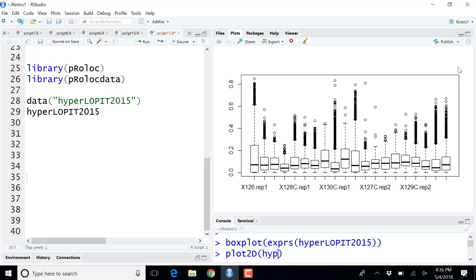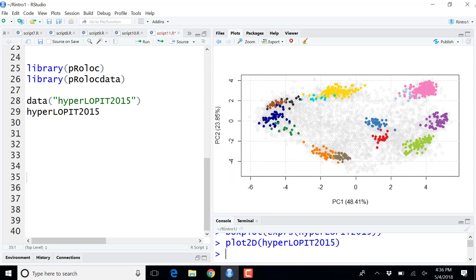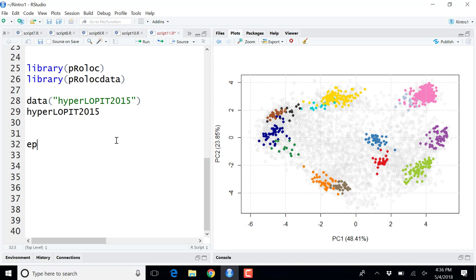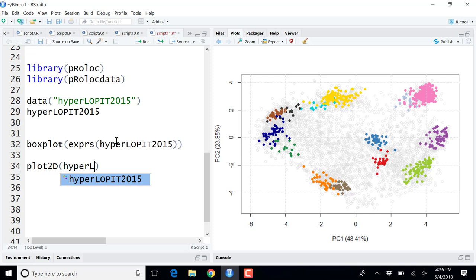And here's a final figure that I would like to show you. Let me type this here, so you have it. This function would create a PCA plot and a summary of your data, where each point represents one single protein. So we have 5,032 points on this figure. But instead of each protein being defined by 20 values for the 20 samples, it's summarized along 2 dimensions, principal component 1 and 2, that are representative of the data.